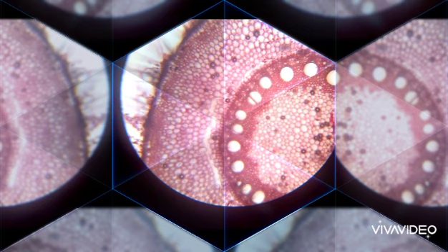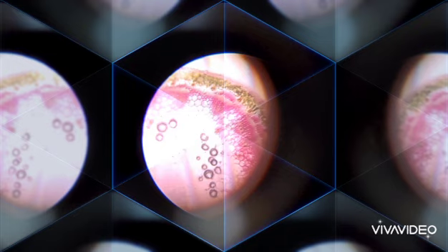The epidermis is a single layer with well-developed cuticle, epidermal cells, and stem hairs. Coming to the cortex, it has two regions: the outer cortex is collenchymatous and chlorenchymatous, whereas the inner one is parenchymatous. Coming to the stele, it consists of an innermost layer of the cortex which is endodermis, followed by a large number of vascular bundles arranged in the form of a ring. Each vascular bundle is conjoint, collateral, open, and endarch type. In the center there is a large pith, and in between the vascular bundles there is medullary rays.